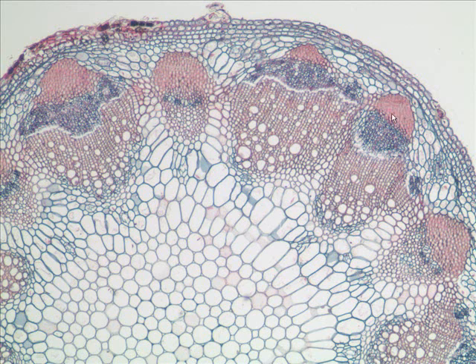These are fibers. What kind of tissue is this? Sclerenchyma. Inside that there is phloem. Inside that there is xylem. What would this be here, if anything? It could be just totally xylem and phloem, but it could be some residual what? Procambium right along in there.